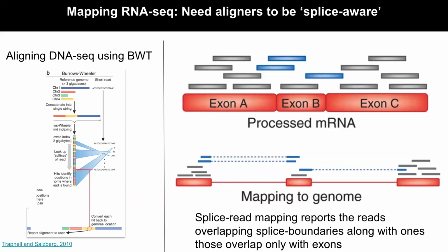If I start mapping everything to the genome, it is a continuous body, which is made up of exons, introns, exons. When you get the gene, so this is your exon. When you get the gene, if you do this DNA sequencing, whatever is here doesn't matter, you're going to get contiguous sequences. Your fragments are going to be contiguous, right? But when I do the RNA work, when I do RNA, these things would have been joined together.